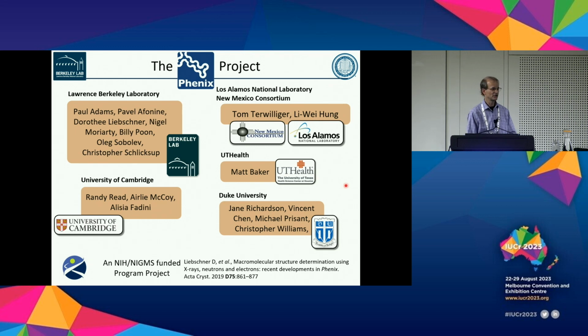But you get to average in tomography, and I think that's going to be very powerful. Our software can do that in a very simplistic way, but later generations will do any kind of averaging and prediction that's necessary.